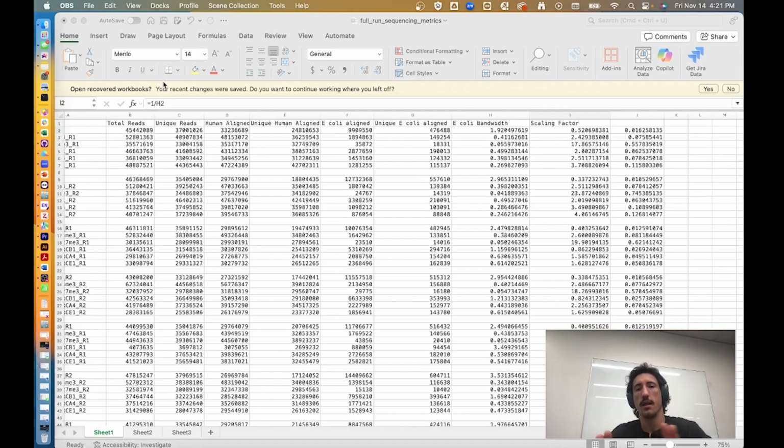For instance, the IgG control has not that much starting input DNA into library prep. You typically get under a nanogram or less. For a mark like H3K27 trimethylation, you get a ton of starting material, up to like 30 nanograms. And you ultimately load 5 nanograms into the library prep, but this is just a very drastic difference in the amount of starting DNA.